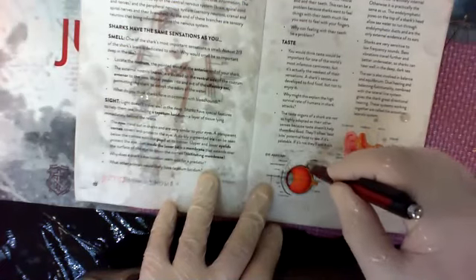Which brings me to one other special feature. This is a human eyeball, but there's a wrapper around the back. It's a mirror, really. It's a biological mirror, full of little tiny crystals that have colors to it. So when light comes into a shark's eye, it goes through the pupil, the lens, and the aqueous humor. This is all fluid, like a gel. It hits the back. The shark sees that image, but the light actually hits the mirror and goes back and hits that layer of receptors a second time. So a shark can actually see way better than us in the dark because it's getting at least twice the light sensation. Other animals like cats and dogs have these too.